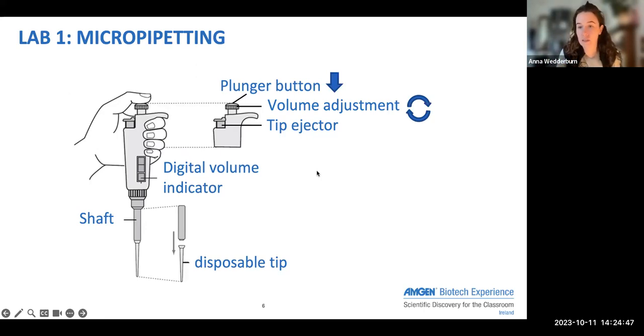In terms of actually holding a micropipette, I'm sorry I don't have one with me today, so I can't actually show you. But this diagram shows it pretty well. What I tell people who haven't used a micropipette before is to put out their hand as if they're giving a thumbs up, and then the hook part of the micropipette hooks over the front of their fingers, and that's how to hold it.